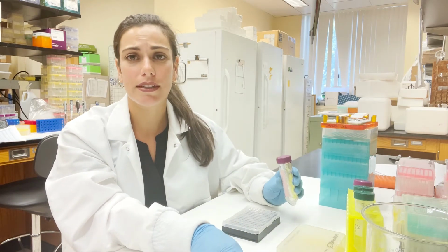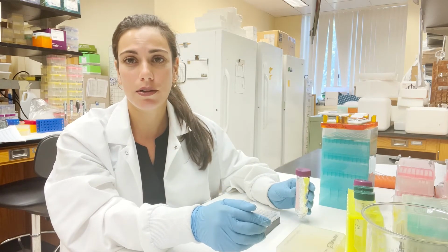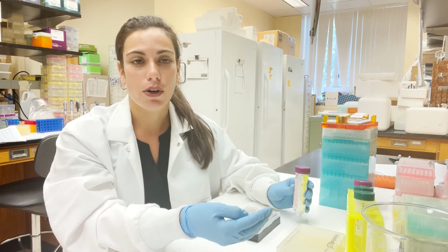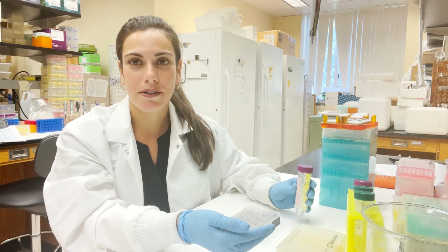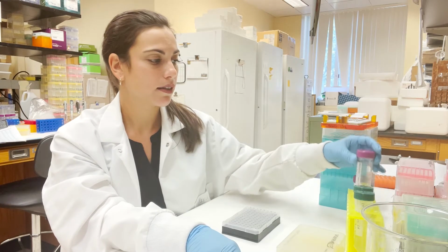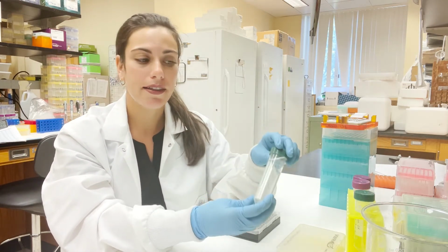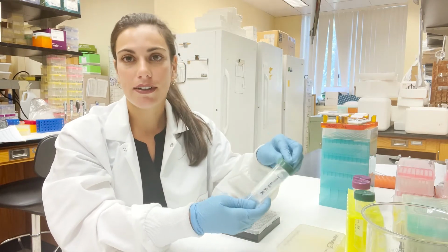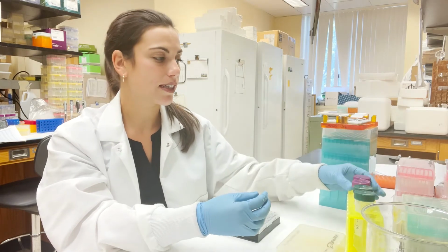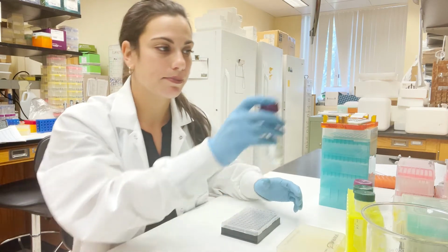Now this step uses a lot of tips, so I try to minimize the amount of tips that I can use where possible, but you don't want to risk contamination, and you do need to mix very thoroughly, so you need to go through many boxes of tips, unfortunately. The other solution is fresh ethanol. So this has to be 200 proof molecular grade ethanol. We make 70% fresh every time that we do this protocol. Then after that, the first step is to vortex our beads and add them to every well. We add 20 microliters.